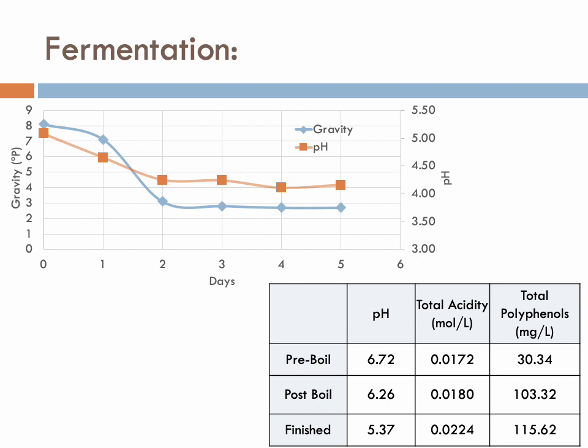And you can see, again, I took a sample from what we had before we boiled it, from after we boiled it, and then after that finished beer at 14 days. So you can see the pH didn't really change through the boiling, but it did decrease after finish. But not as much as some other things, right? That's going to be a function of the fact that it turned out to be fairly weak. I think our alcohol percentage on this was like 4.5, so not great.